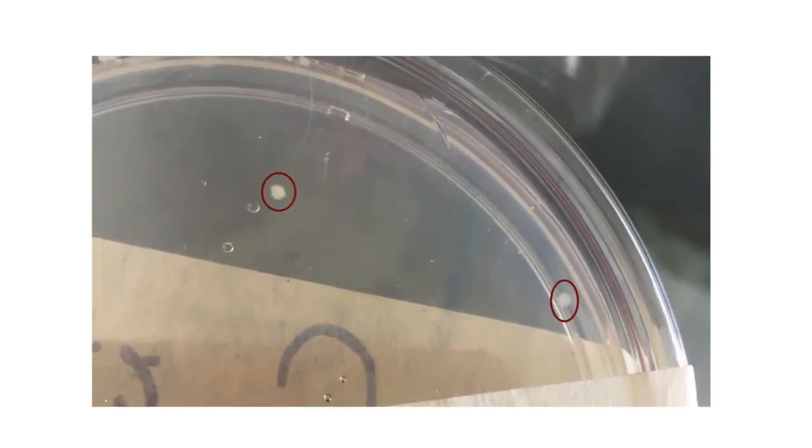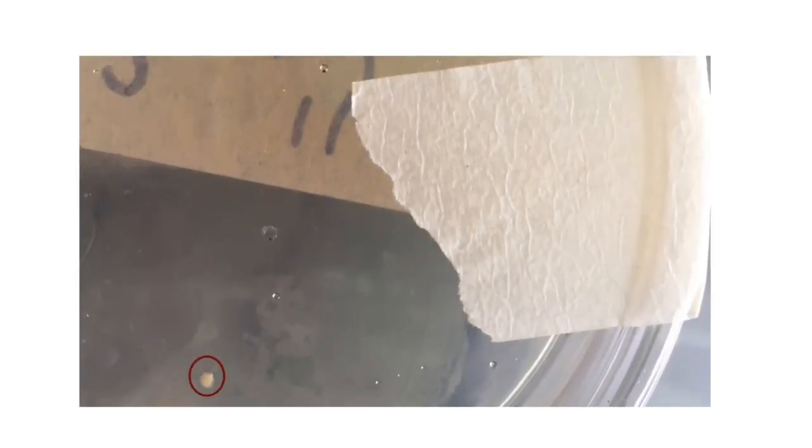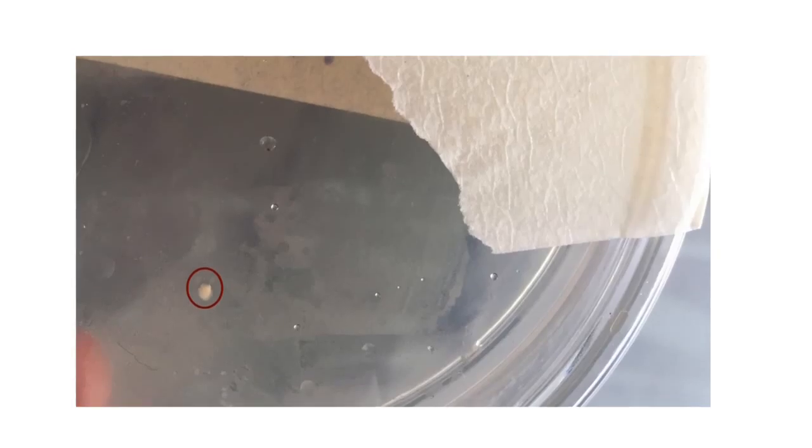In the petri dish, only 3 colonies grew. None of them show expression of X-gal, which means that the plasmid was not successfully inserted in the cells.